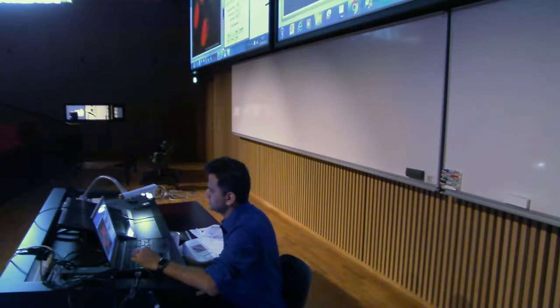So here. Select. So this is how it is segmented. Now you switch off, go to the other one, and now you can do the segmentation likewise here. For green, you can select, switch on, switch off. That's for the red one, right? And then select. So now you have everything on actually.